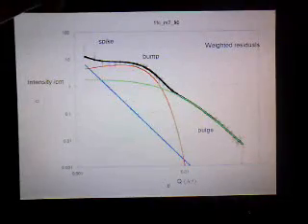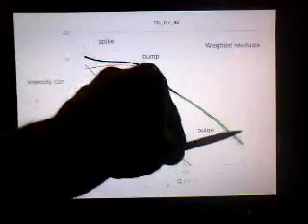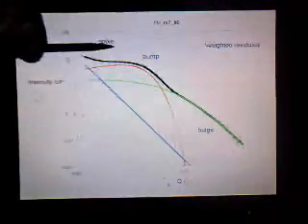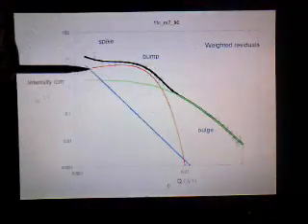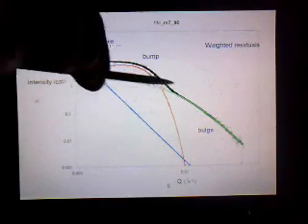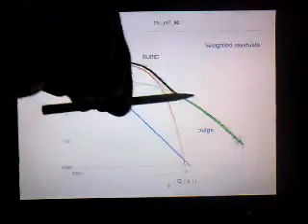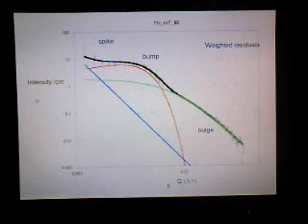I should point out that these data required two detector settings: a detector setting very close to the sample to measure high Q, and a detector setting far away from the sample to measure the small Q. And then we used the NIST software in a region of overlap to scale the two together. This is a correct thing to do, provided the resolutions are the same, which I don't believe is the case.